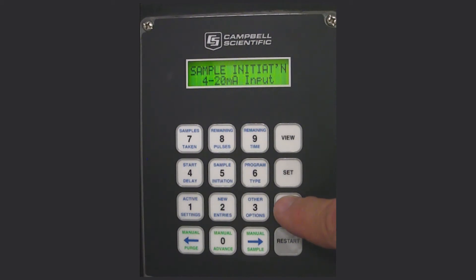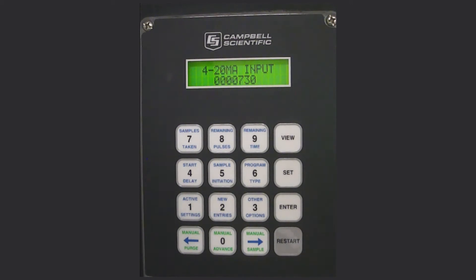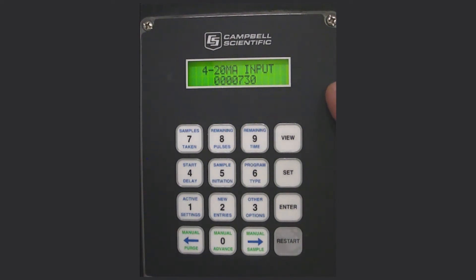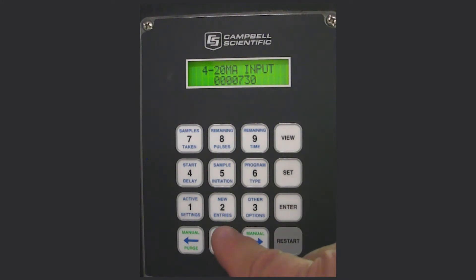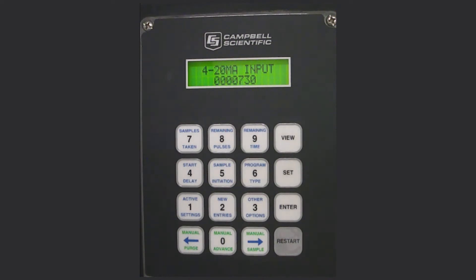To input pulses for the 4 to 20, press enter and enter how many pulses it needs before it triggers. You need to calculate based on your low and high flow rates and average where you'd want it to trigger. In this case I've input the number 730. You can change that number by pressing zeros or scrolling left or right with the arrow until you get the number you want. When finished, press enter.